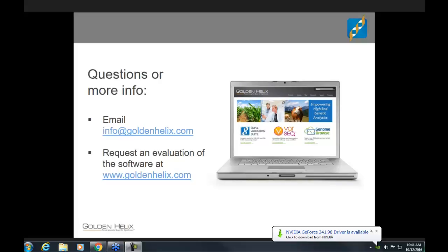We are interested to join the development as a beta client. What is the process to participate? Right, so as I mentioned, we already have some clinical labs that are validating this in that early access mode. So we have received requests like this. What we're going to do is just limit that to existing customers who have this report package. So if you are an existing customer with this report package, please contact us. If you're interested in getting that package, contact your area director at Golden Helix.